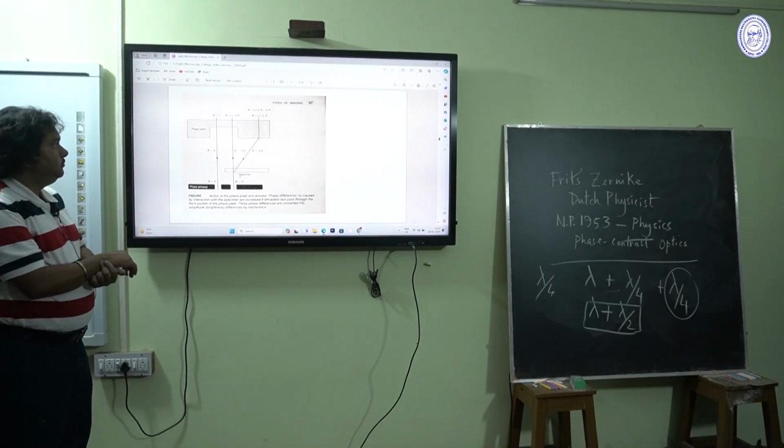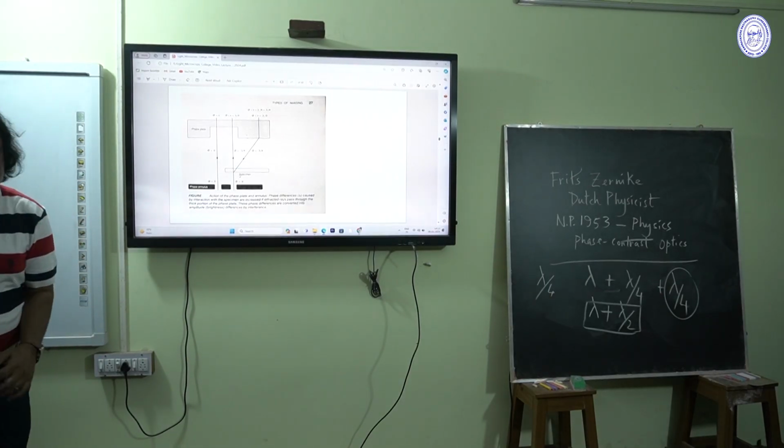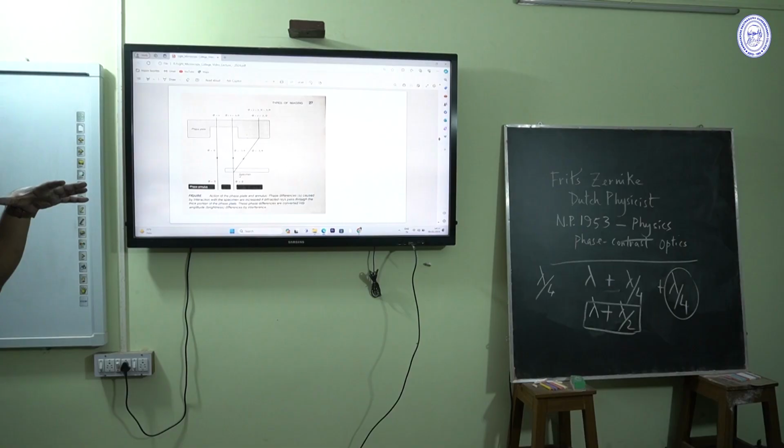human eyes. So by using this microscope, we are able to see the movement of microorganisms, as well as unstained specimens. The drawback of this microscope is that it produces basically 2D images, and it is costlier than a conventional compound light microscope.